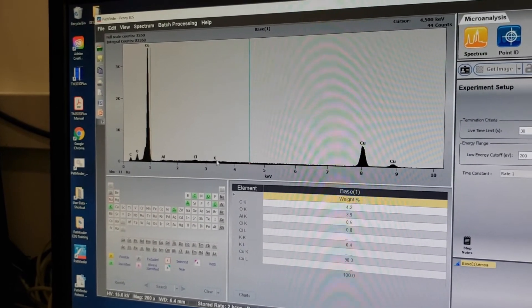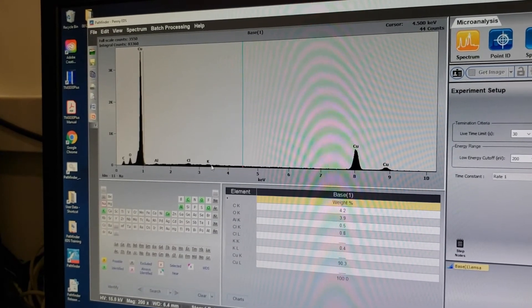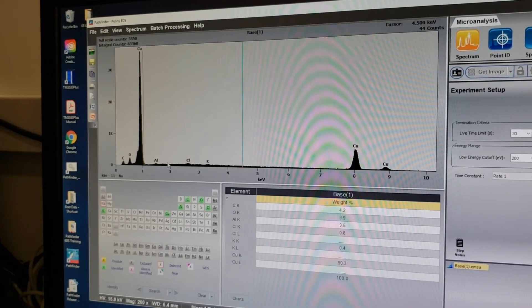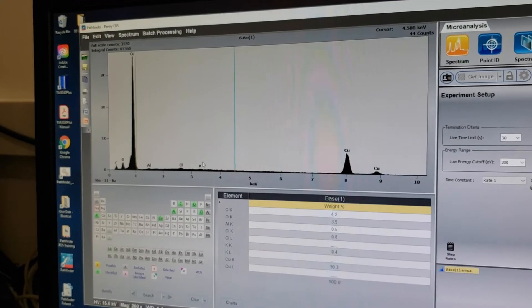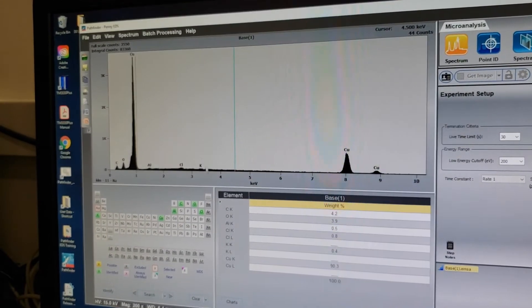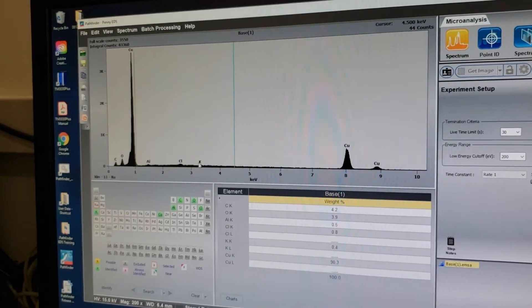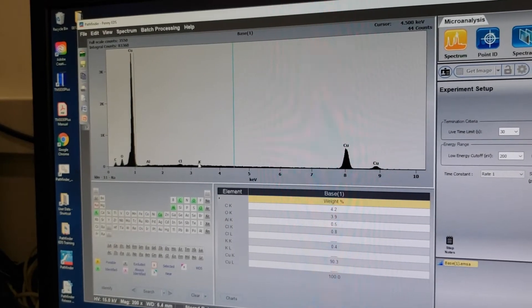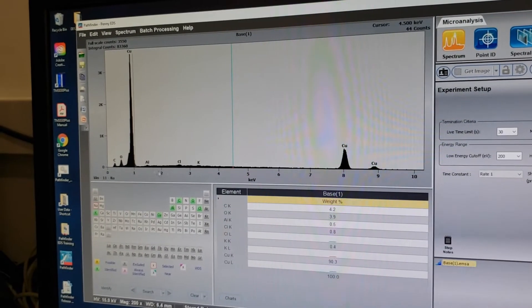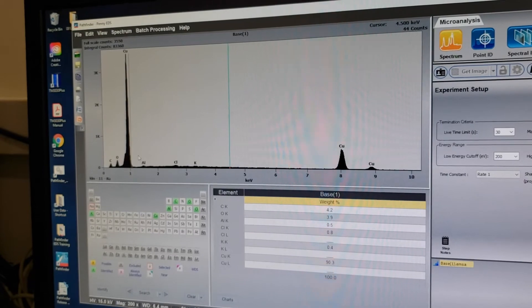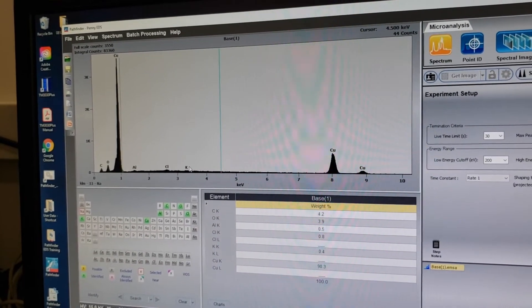Aluminum, chlorine, and potassium show very tiny peaks, and it's possible those aren't there at all — we're definitely within an uncertain range. However, these are pretty common things to have on your skin. Aluminum, chlorine, and potassium come from water, from sweat, from a lot of different things. It's not uncommon for something people have touched to show trace amounts of those elements.